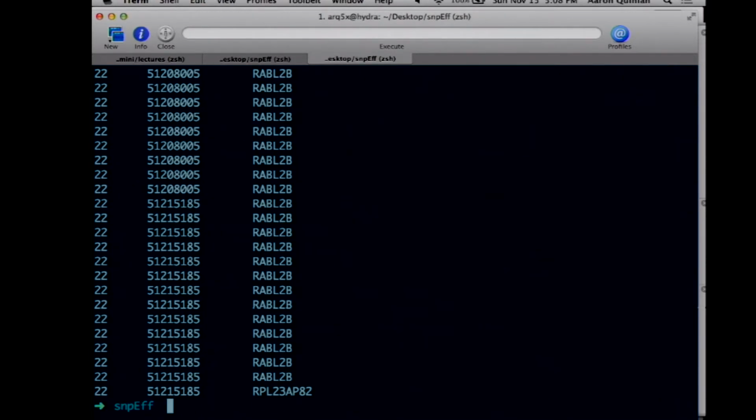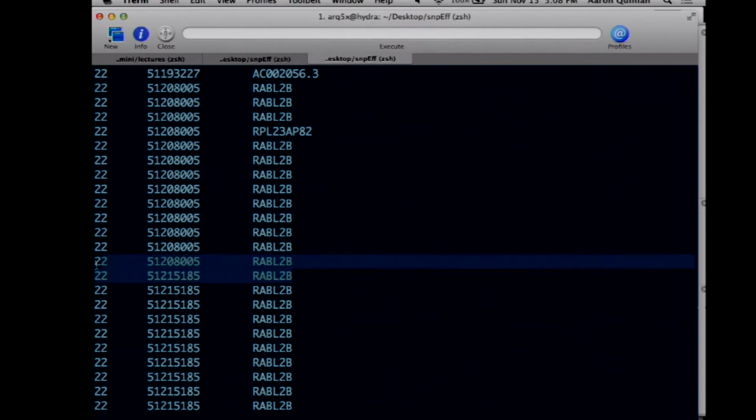Now what do we need to do? So it's a little tricky, right? So what if there are more than just this site affecting this gene? And it probably is, right? So here's the case. So how do we handle this? You would like to keep both of those, but maybe collapse every instance in which the gene name and the number are the same. Yep.